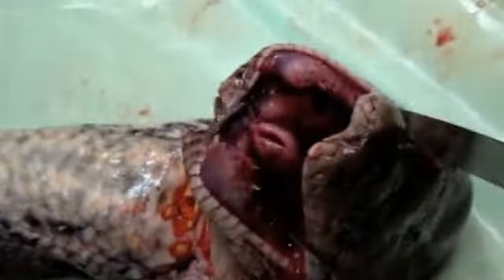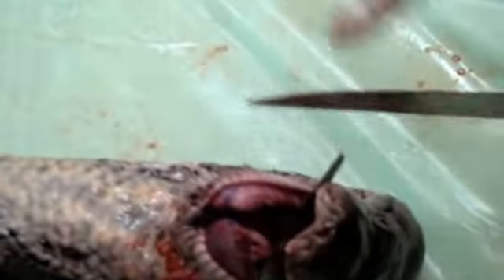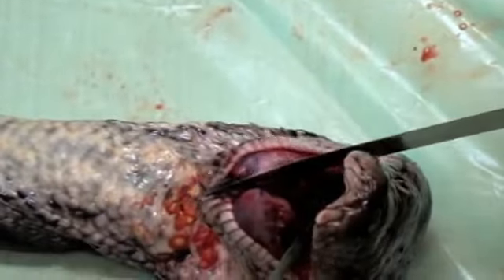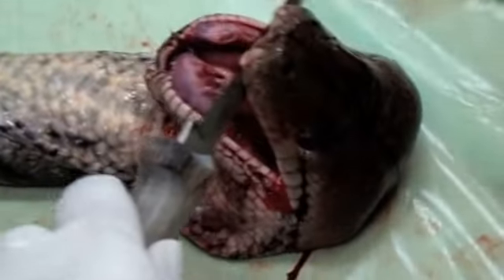Okay, anyone else want to see that? See that? Close up. It can spread up, and it can go open as well. So it can spread in two ways. It has nostrils right there, but that's how it normally breathes, just so you know. So you can breathe through here too.